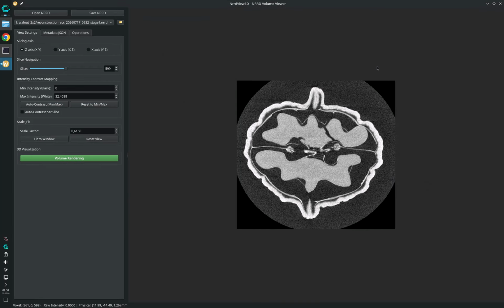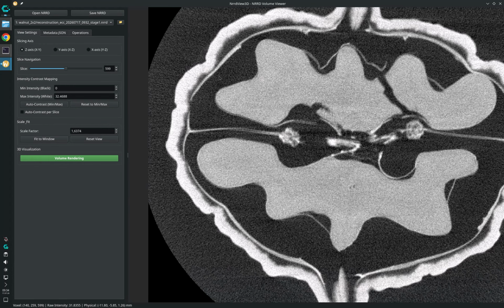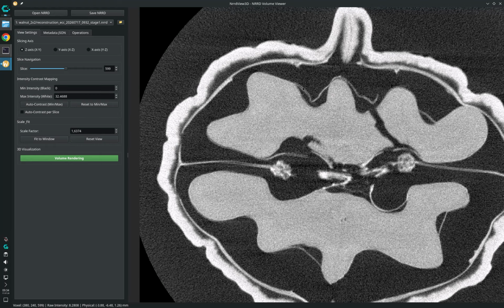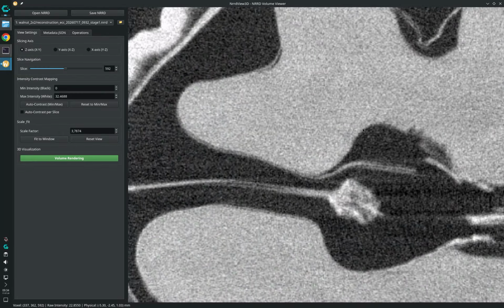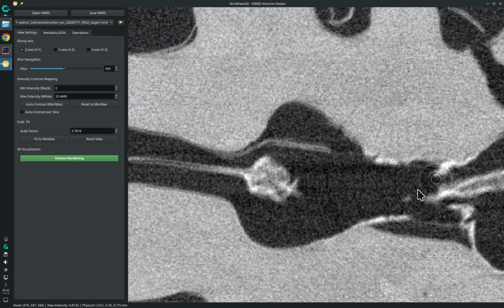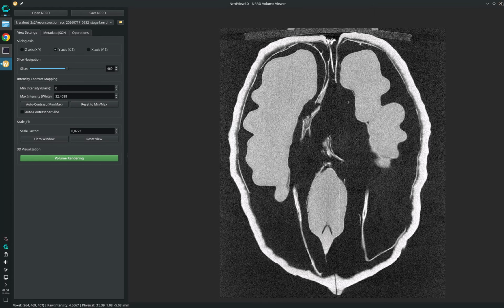Okay, so this is the result. And maybe if you recall what it looked like earlier, this is a lot better already. But it still has double edges, especially in this region here, there's definitely still a double edge going on. And also this is kind of blurred. So I'm guessing there's still room for improvement.